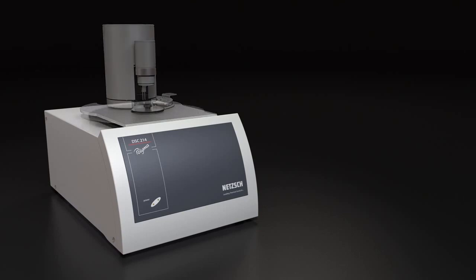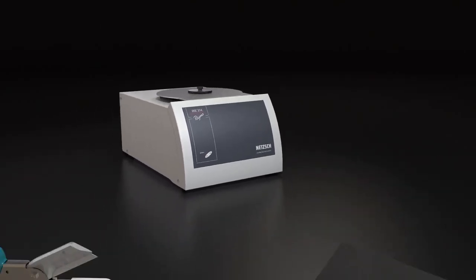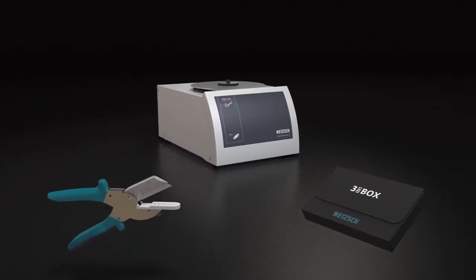We made it possible. The new DSC214 Polyma by NETZSCH. More than a DSC. Your solution.